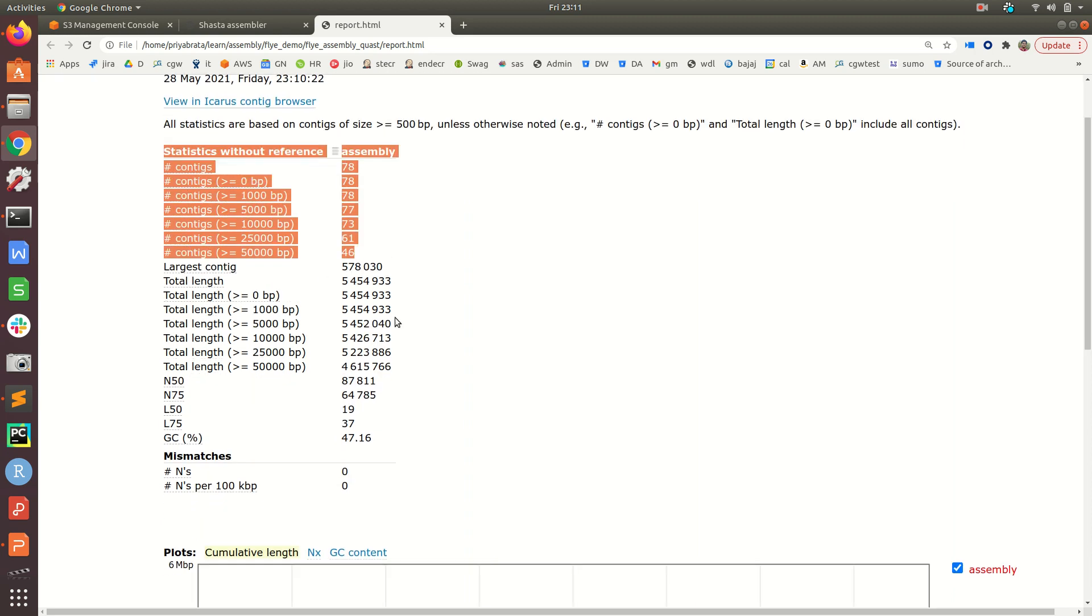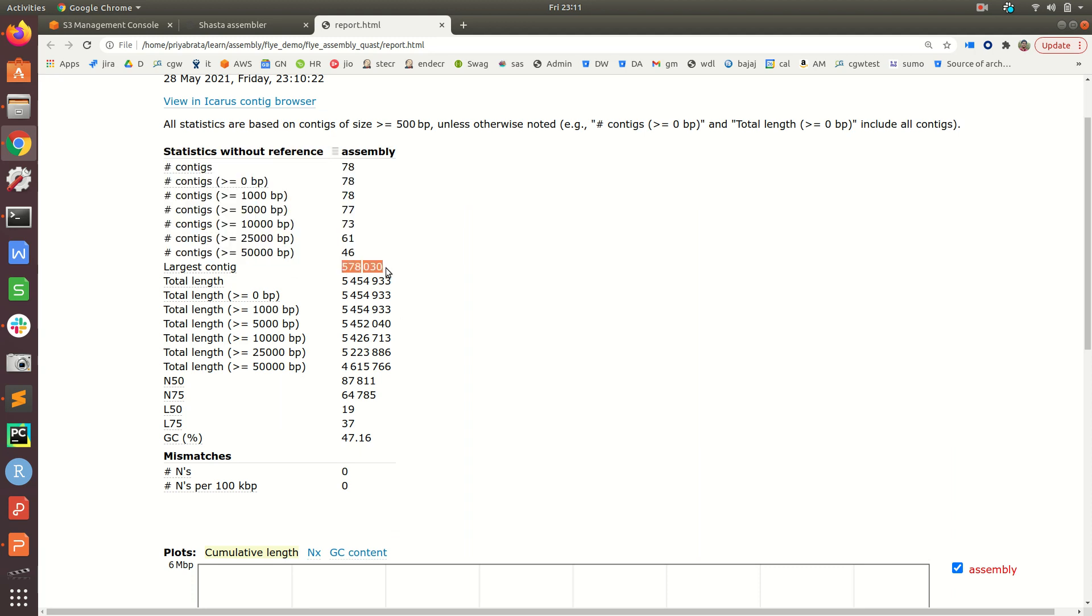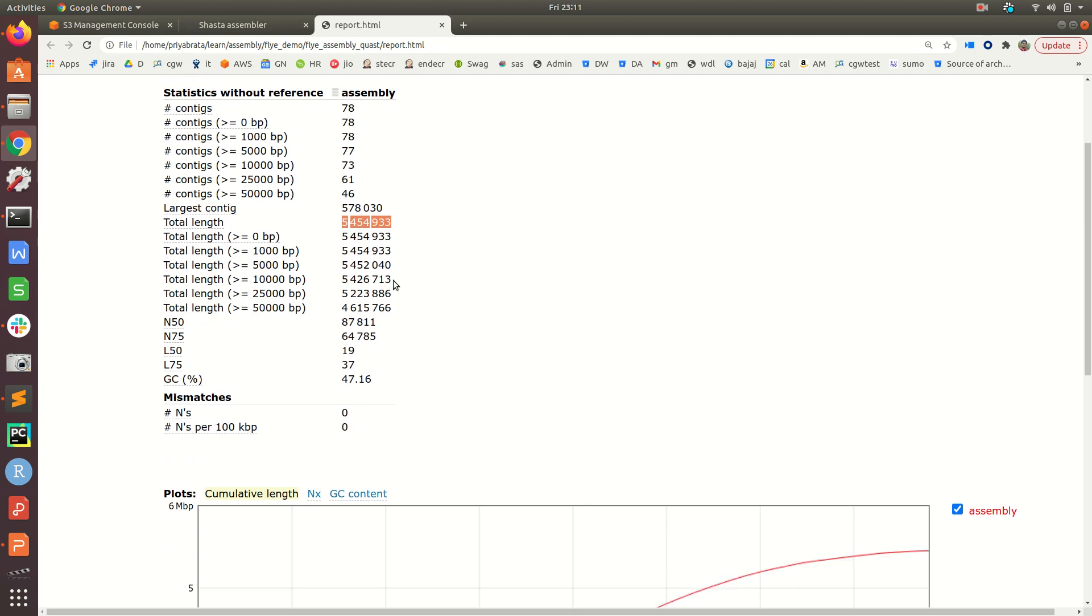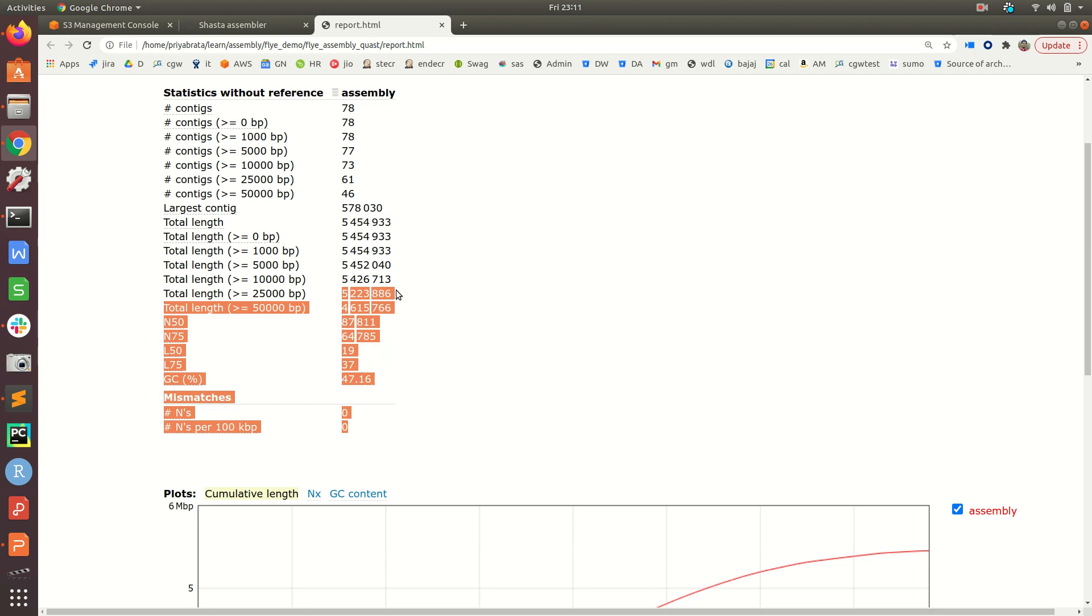This shows the distribution of contigs as per different thresholds. The largest contig length is this, and total assembly size means if we add all the 78 contig lengths together, the genome or assembly size would be roughly this much.